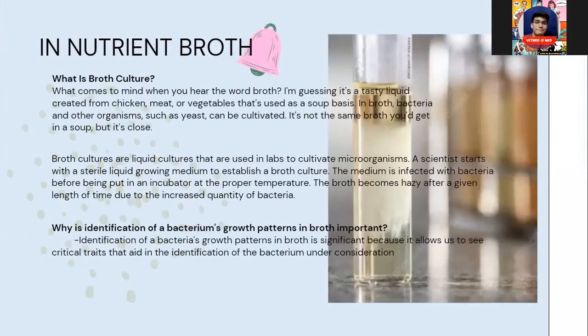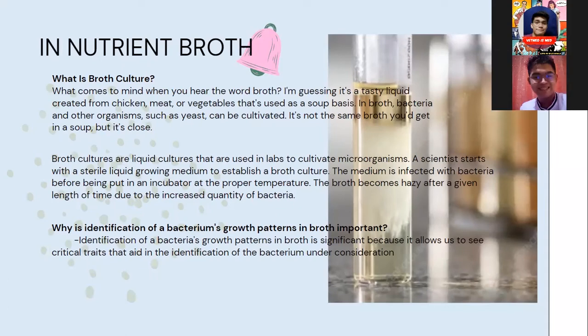Lastly, we have broth culture. What is broth culture? What comes to your mind when you hear the word broth? I'm guessing it's a tasty liquid created from chicken, meat, or vegetables that is used as a soup basis. In broth, bacteria and other organisms, such as yeast, can be cultivated. It's not the same broth you get in a soup, but it's close.